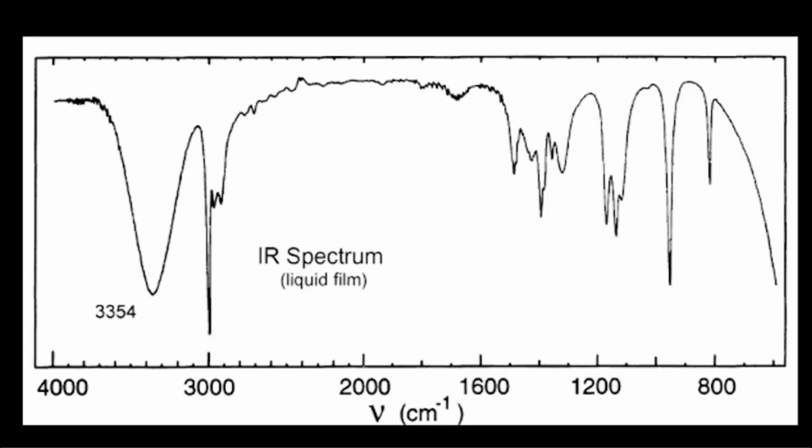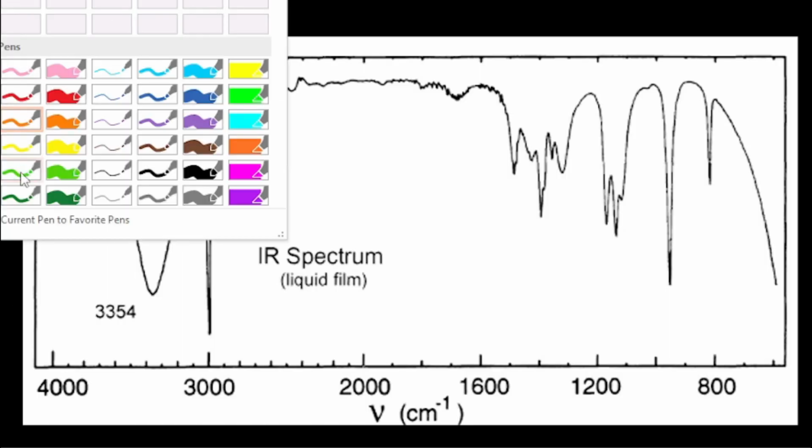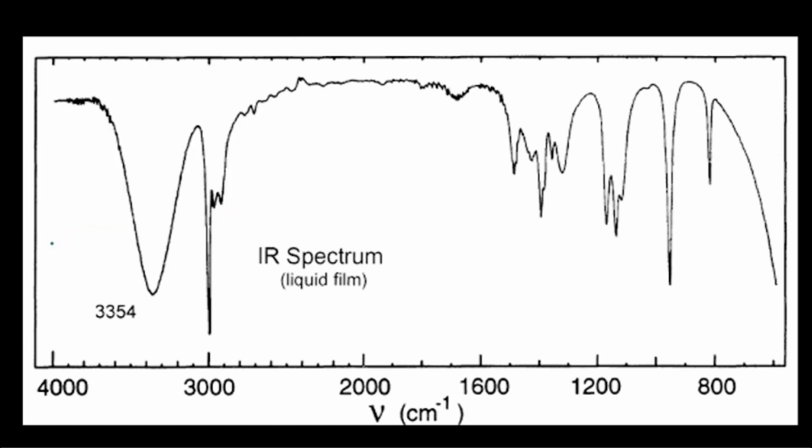So first of all, we will look at the IR spectrum that is taken neat. In the IR spectrum, only this kind of peak is present, at a frequency of 3,354 per centimeter. The other peaks are not very important. The sharp peak I see here is due to the CH stretching. We have already talked about how these peaks give us information, and here we get the bending information about the CH bending vibrations.